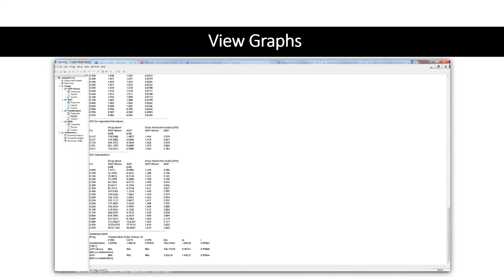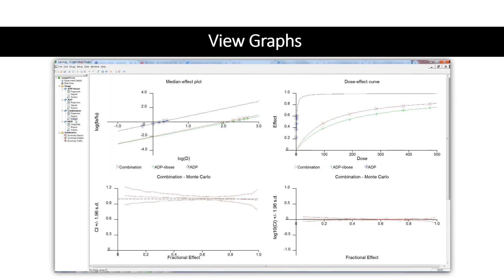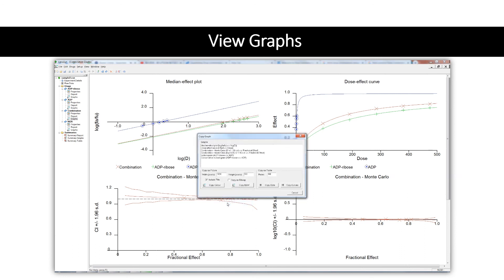To view the graphs, double-click the graph in the contents tree that you want to open. The graph window shows a selection of graphs derived from the data. For single drugs, this will be the median plot and the dose-effect plot. Combination drugs will also show the CI plot. Graphs can be printed using File > Print, copied to the clipboard, and exported to file from the right-click menu.